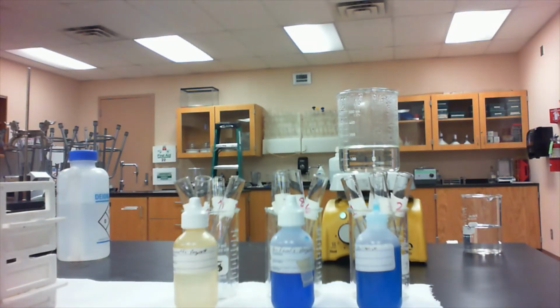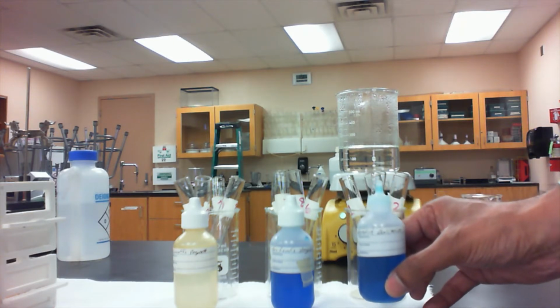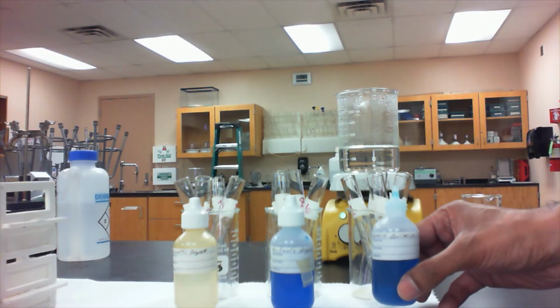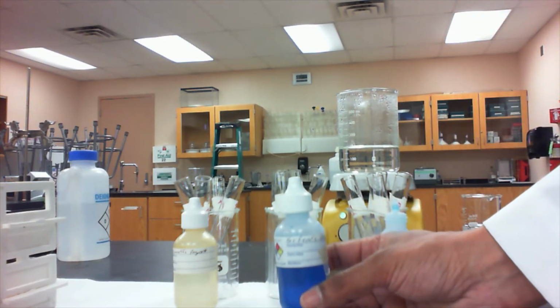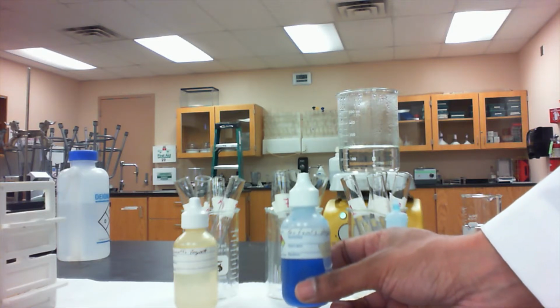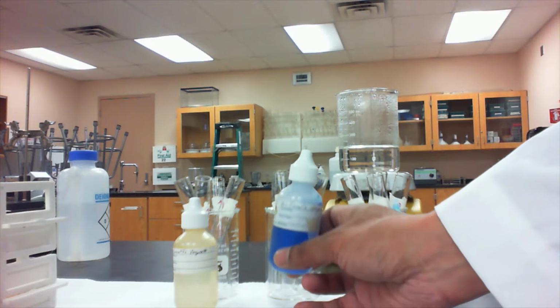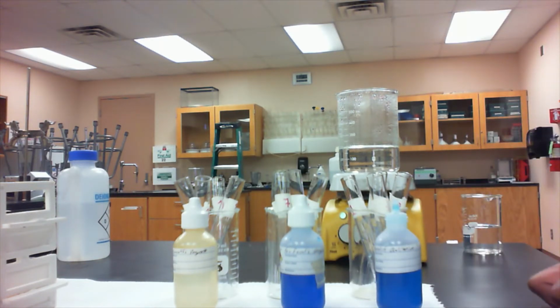Okay, so we're going to be doing these 3 identification tests for carbohydrates. Just to remind you, the Benedict's test detects reducing sugars versus non-reducing sugars. The test using the Barfoed's reagent is able to distinguish monosaccharides versus bigger types of sugars.